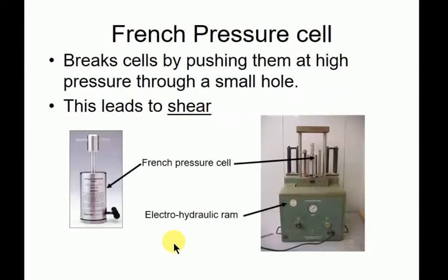This is the thing you would choose if you're working on a membrane protein complex or a sensitive protein, or if you want massive efficiency. This is a French press, and this is a really nice method of lysing your cells. So you have a very, very heavy, very nicely machined chamber here. If you pick this up, the one thing you don't want to do is drop this on your foot. I've seen this break someone's toe. So you've got a heavy, heavy chamber. It's beautifully machined, so you have to treat it very carefully.